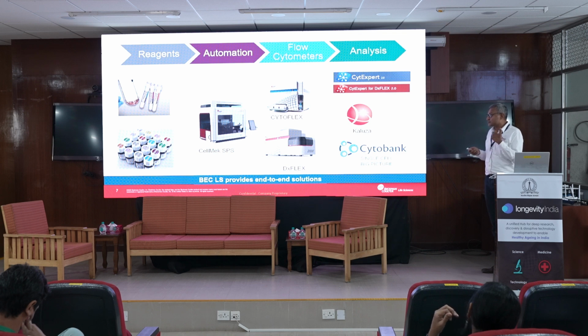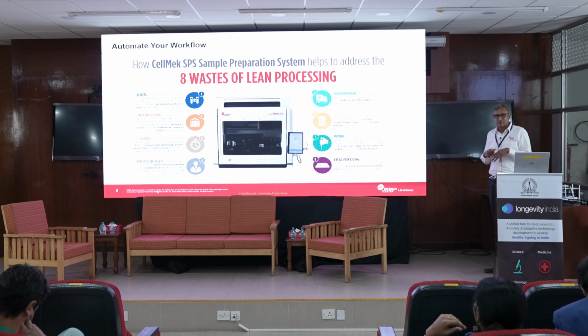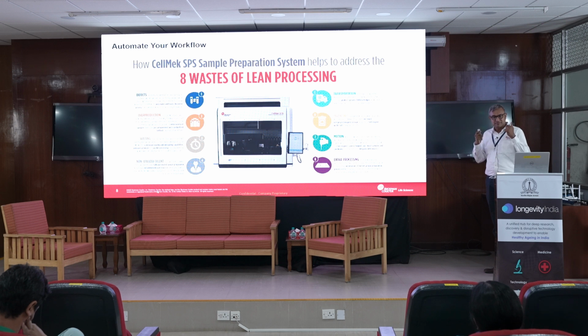And we also have a lot of software for deep analysis. Especially I wanted to mention the Cytobank software. This is for the meta-analysis of the immune system. Basically you can combine an enormous amount of data to study different cell populations and how they are altering in different conditions. So basically what we are talking about is a robust technology of how to study the immune system in a very standardized, in a very proper way, so that you get very reliable results.